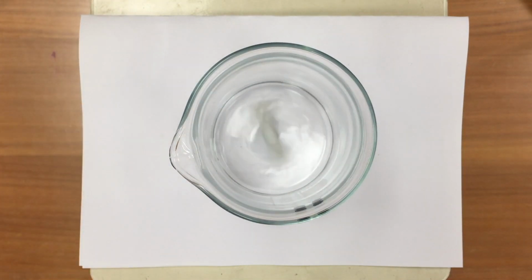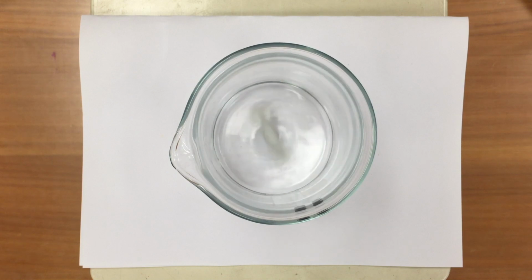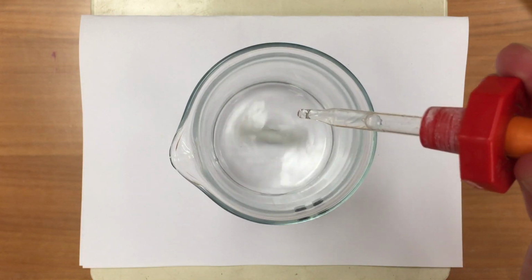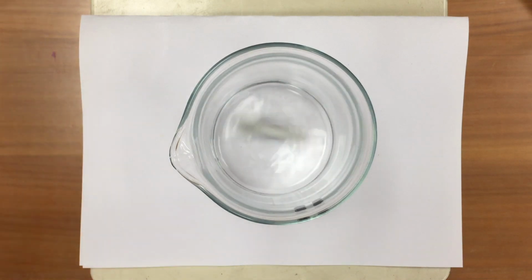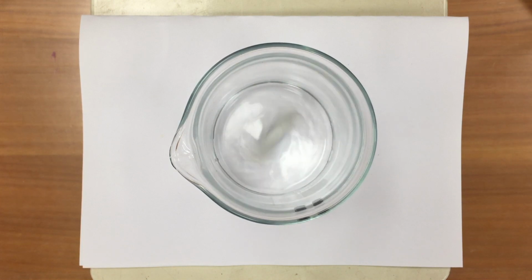Now if I just go and pour some sodium hydroxide in there and keep looking to see when the experiment's going to be finished, I'm going to be waiting for a very long time, because without an indicator I wouldn't see anything. So I'm going to add some phenolphthalein as my indicator. Phenolphthalein is colourless when in acid and pink when in base. So I put 4 drops of phenolphthalein in there. As you can see, it stayed colourless because I've started with hydrochloric acid in my beaker.